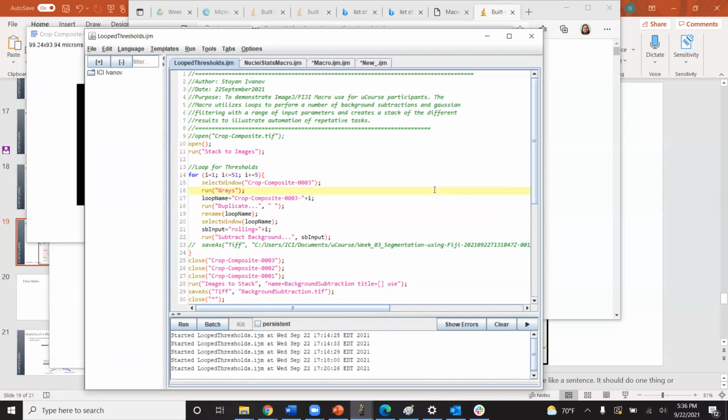Image analysis together, subtraction, addition, denoising. And I've mentioned several times, but it's really important to remember, if you've got a lot of data and you analyze it in a similar way, this, if you can get it working, will be fantastic.